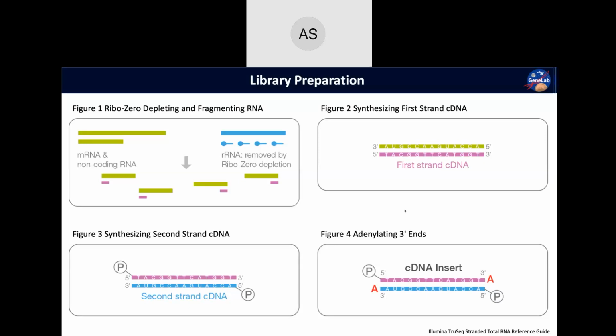So things like that, you would want to know the strand that it was originated from when you do the synthesis from, right? So that's the advantage. So you want to know the origin of your RNA source or your RNA input, if that is something of interest to you in your final work. That makes sense. That sounds right.